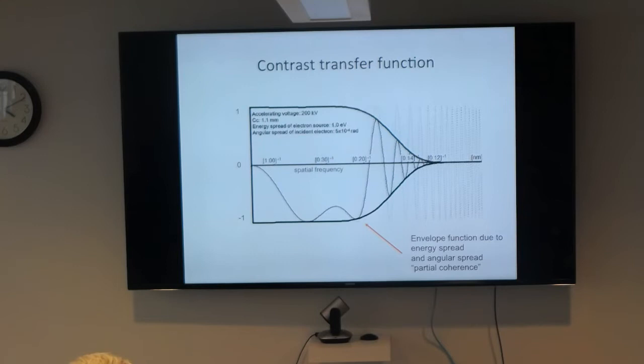Now we don't have any wave aberrations, which means that this 90 degree shifted scattered wave interferes with the primary wave that has not done any phase shift. When they interfere, they don't do anything to each other. They don't interfere. They're sort of orthogonal to each other. There's nothing. An ideal instrument, an ideal electron microscope, shows you nothing. That's the paradox. We need wave aberrations in order to get contrast. So the instrument needs to be non-ideal in order for us to see anything.